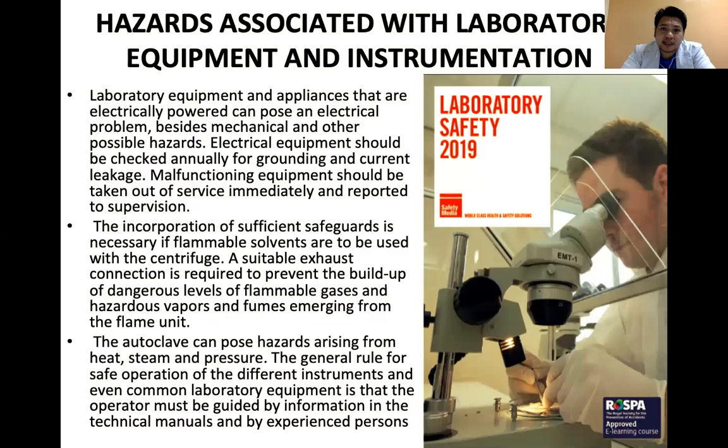Hazards associated with laboratory equipments and instruments. Ito, marami ito. Laboratory equipment and appliances that are electrically powered can pose an electrical problem. So aside from electrocuting a personnel, those equipment class also are the cause of fire hazards.